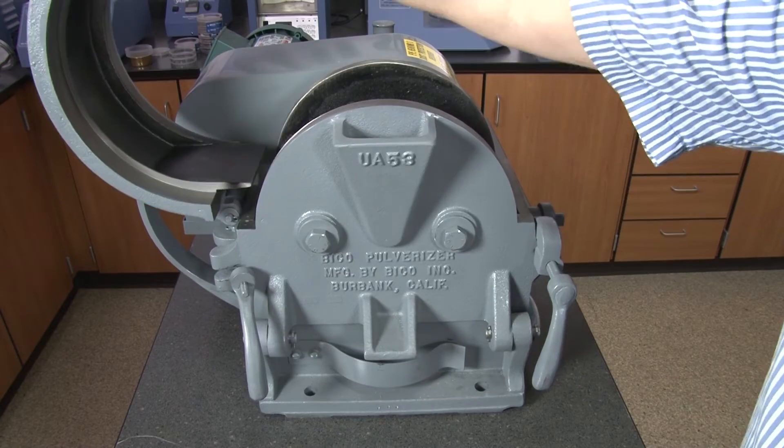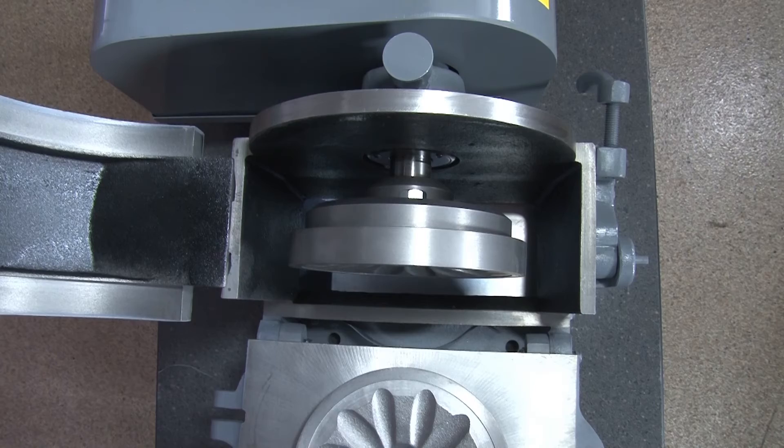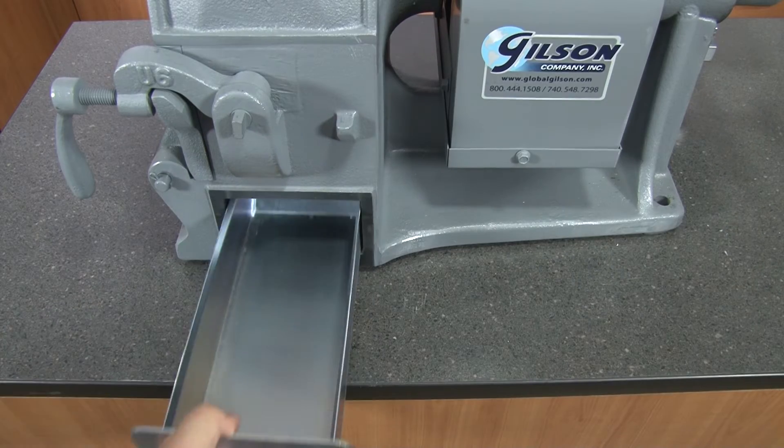The grinding chamber is easily accessible for cleaning and maintenance, as well as allowing the operator to see all processed material be brushed into the catch pan.